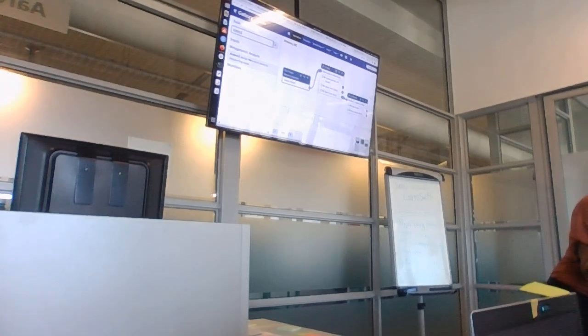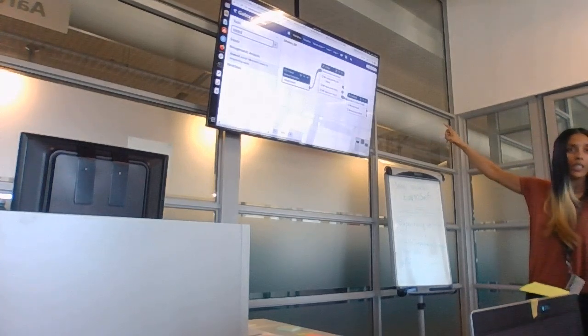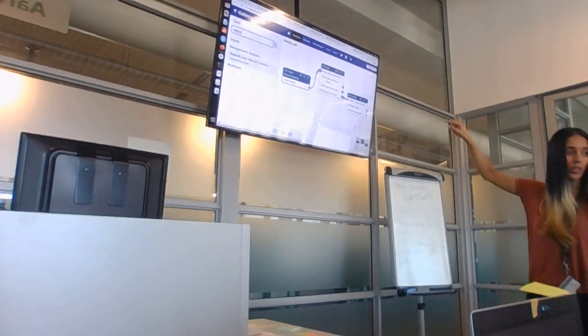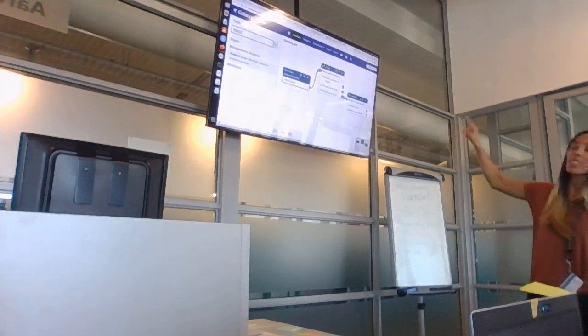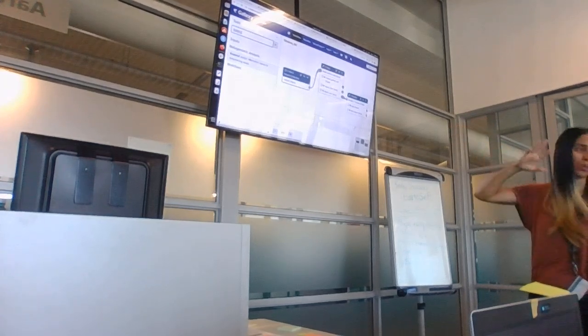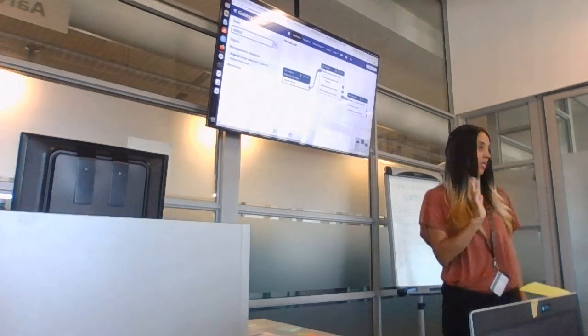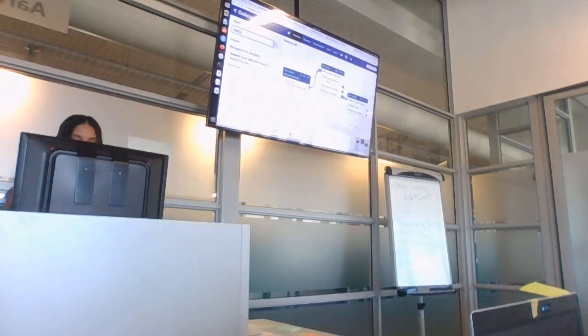Oh, save. No, that's why. But the problem is that this is just a demonstration of how you can add it, but in this case it's not a good idea because obviously you don't have the single ones. What you could do is make a copy, add another input to this, but that will complicate it. This is just an example. You're right, it's not accurate. This is the one. Yeah.